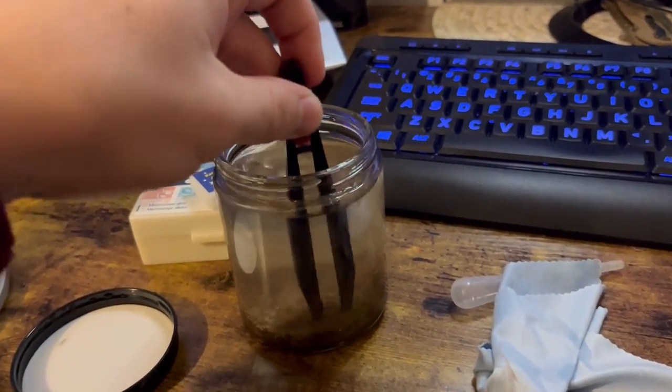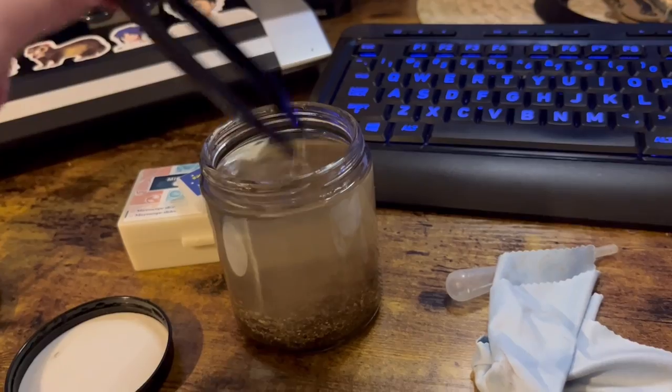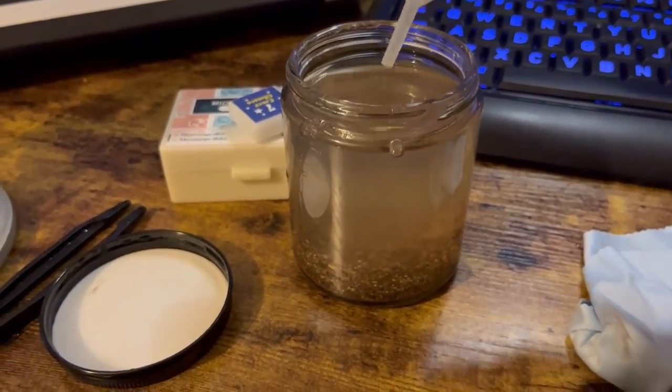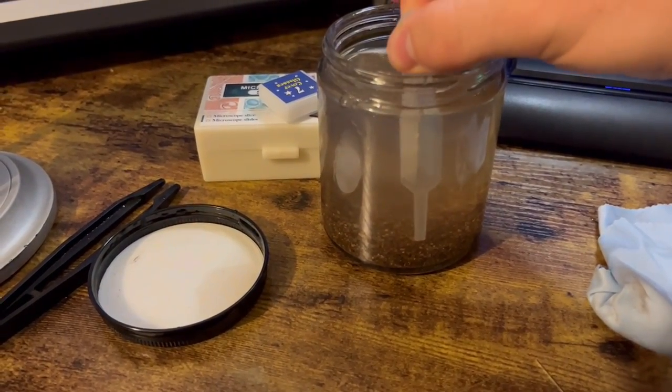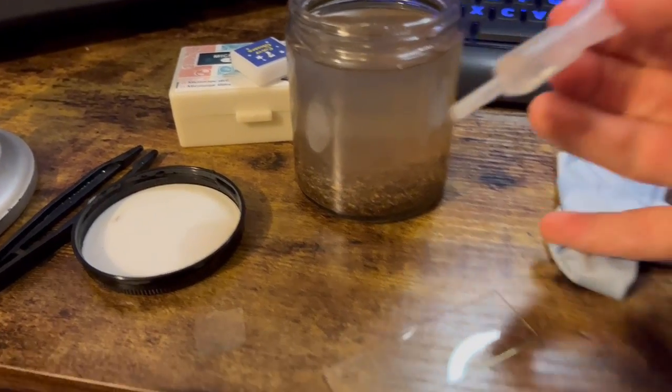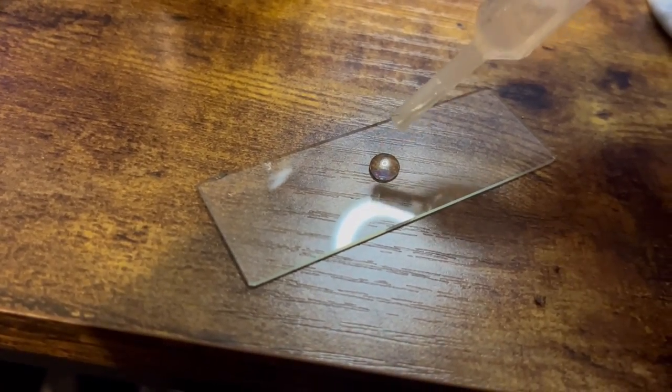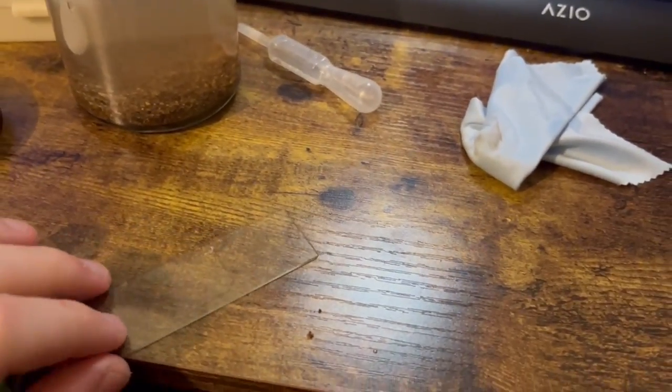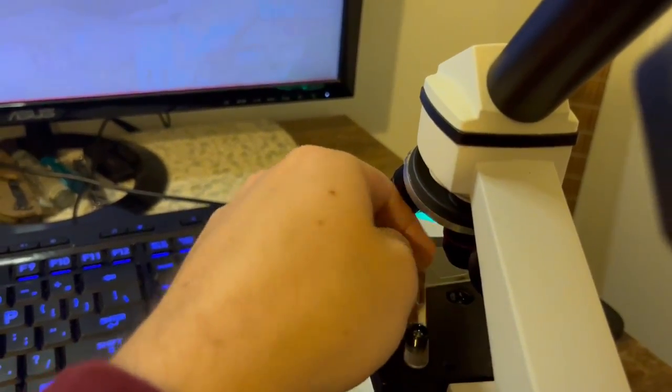Luckily the microscope has this handy phone holder so we should be able to record some pretty good video. So we're just gonna stir up the water here to get everything that's settled moving again. Then I'm going to take my pipette, fill it up with water from near the bottom, near the rocky area. Put that drop of water right there, take the cover, drop it on there. Now we can go ahead and take this slide, put it under the microscope and move to the microscope view.